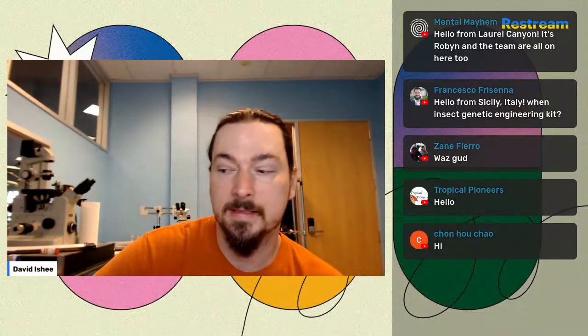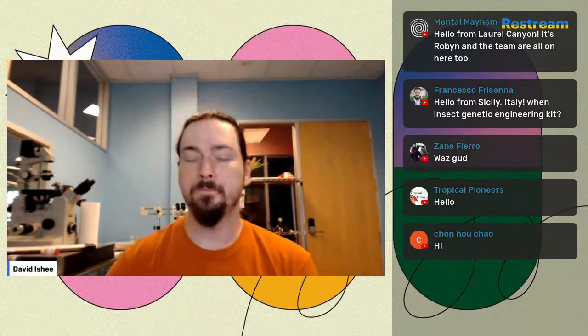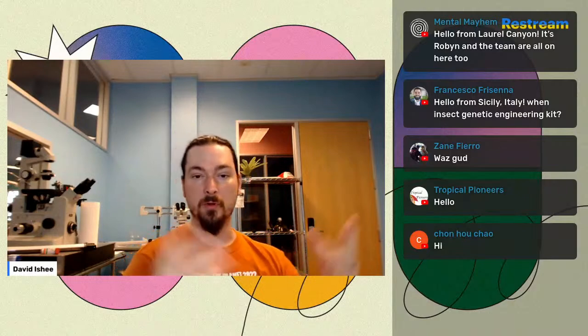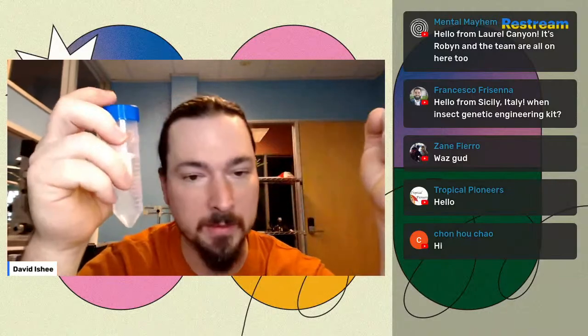Now, agroinfiltration, as was discussed last time, uses bacteria, these guys, right? So they're growing on a petri plate. And they have a special mechanism that they use to modify plants. The general protocol is pretty straightforward. You have a special buffer, right? Which is this stuff, which comes in the kit. It comes as a small tube, and you mix it with water, and it makes a large tube. So it's a concentrate.